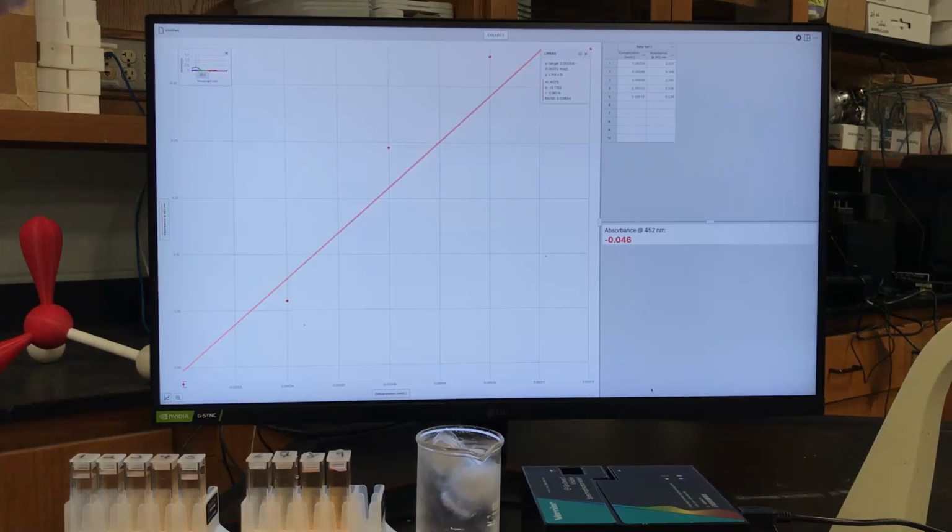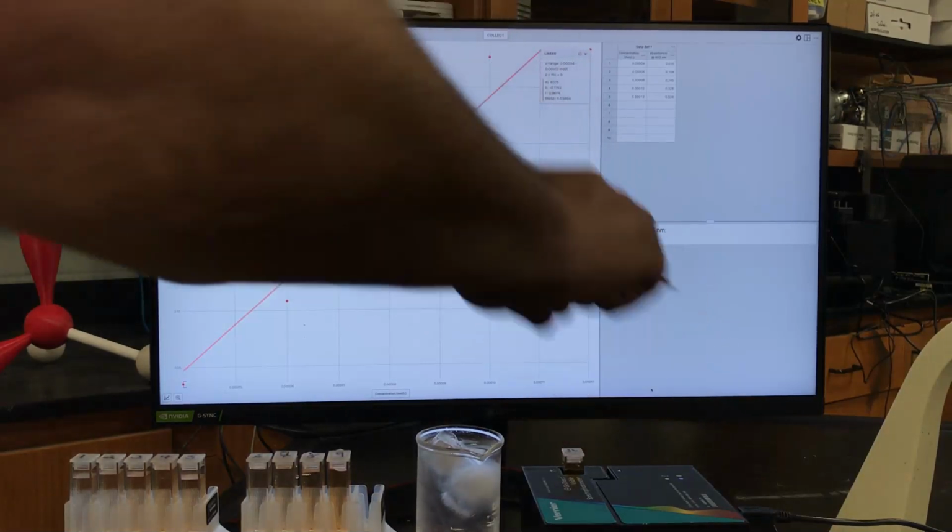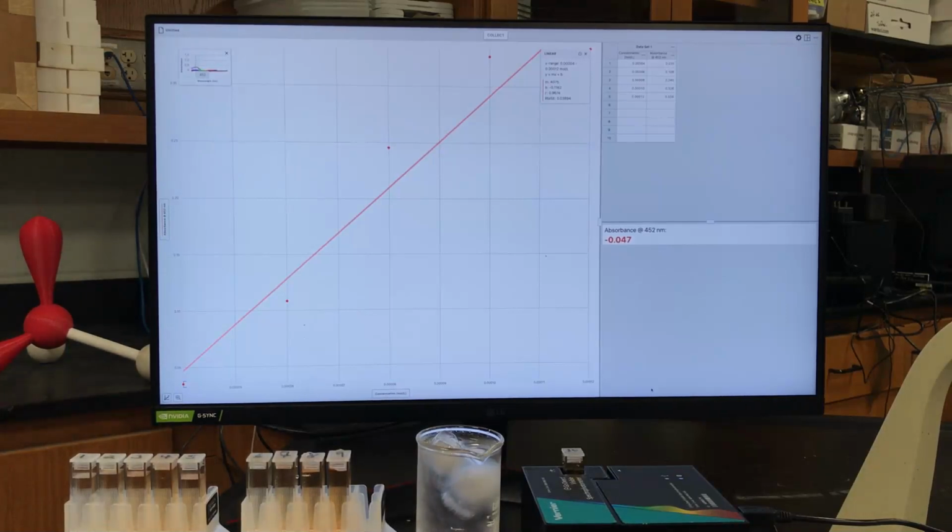So now I'm going to put this in. All right, in my spectrophotometer, make sure I have the ridges on the right side. Okay, and now I'm going to read the absorbance. 0.611 was what I had at room temperature, and now you can see it's 0.862. And actually, as it warms up, it's dropping. As temperature increases, the absorbance goes down. But when it was colder, the absorbance went up. So this is telling you something about how equilibrium is shifting. So in the spectrophotometer, it is clearly warming up and going down.